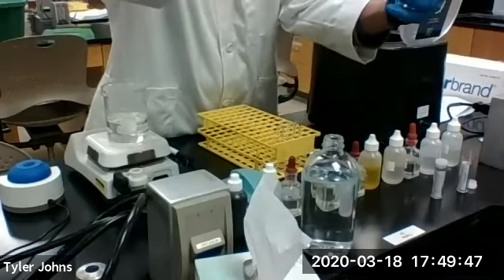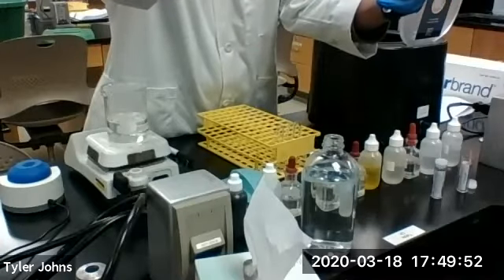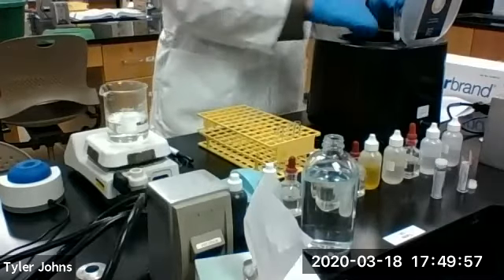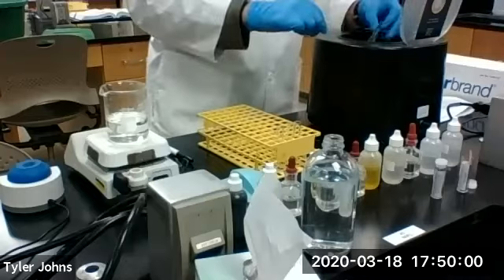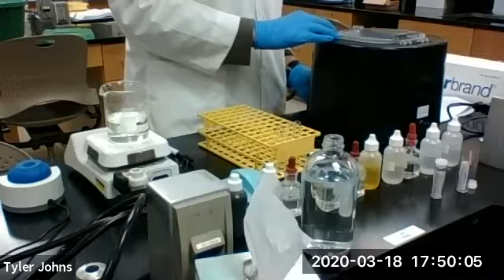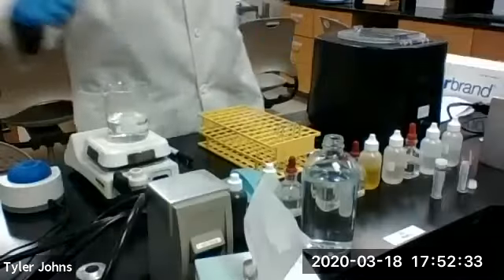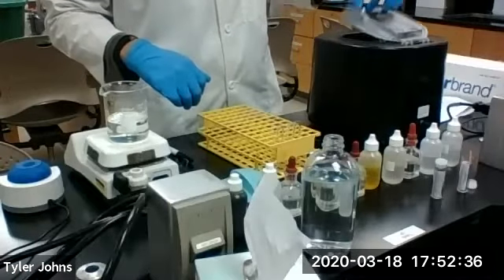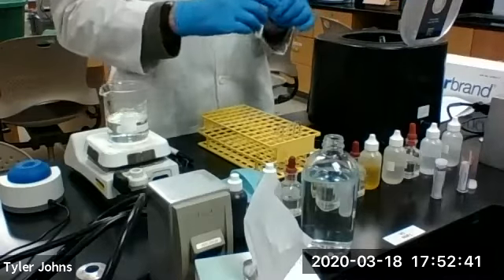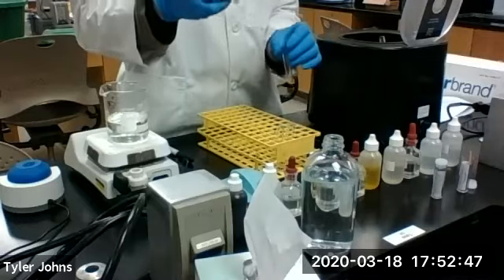Make our balance. We'll centrifuge our precipitate down. Okay, so our centrifuge has stopped. We're going to remove our magnesium ammonium phosphate hexahydrate in our solution. We're going to discard the solution.